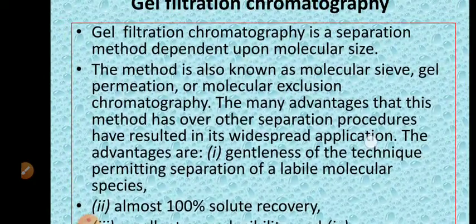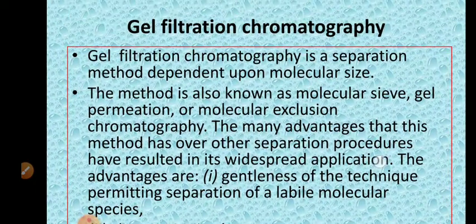Gel filtration chromatography is also known as gel permeation chromatography or molecular sieve or molecular exclusion chromatography. And this technique of separation is dependent upon molecular size. That means gel filtration chromatography brings about the separation of components of a mixture depending upon their molecular size.